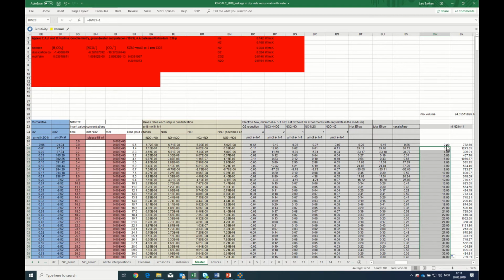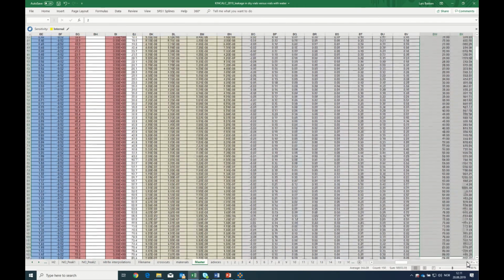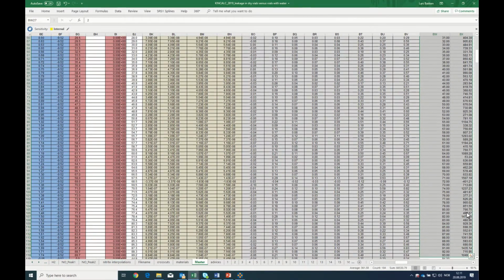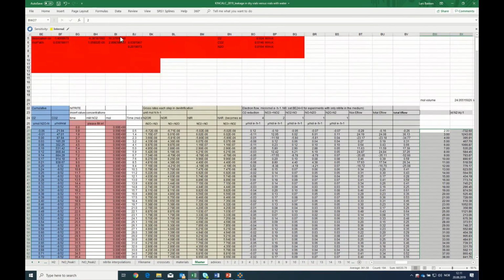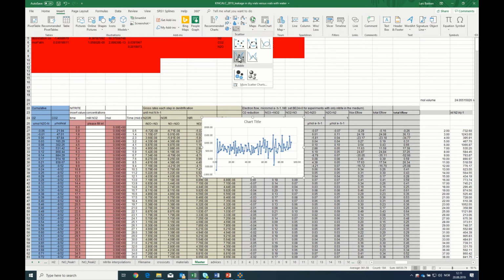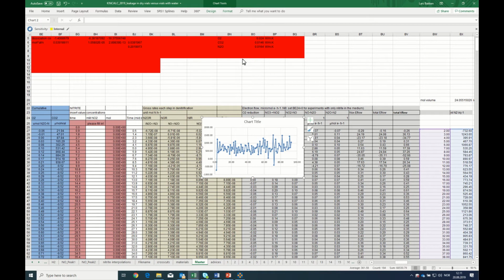and then I can make a graph showing the leak rate in nanoliters of N2 per injection, and the net injection numbers are here. It's noisy, but it is something between 500 and 1,000, and the average is 700.